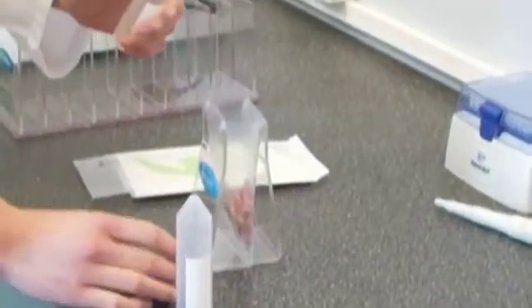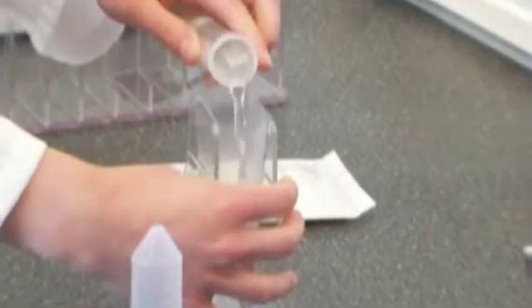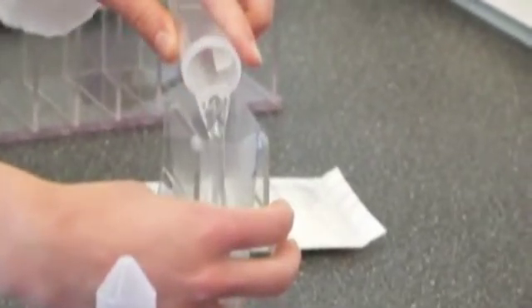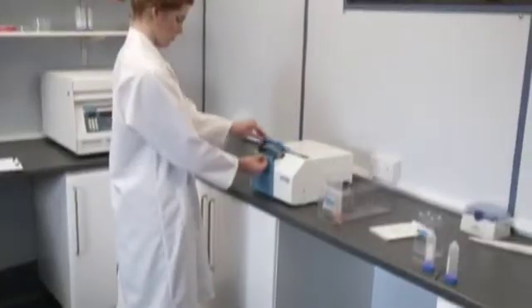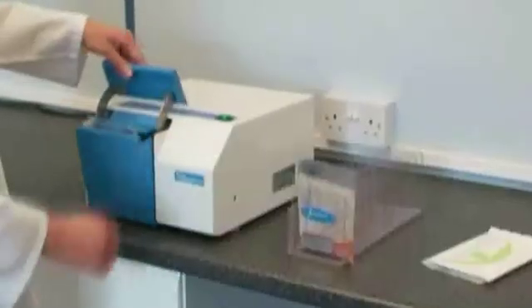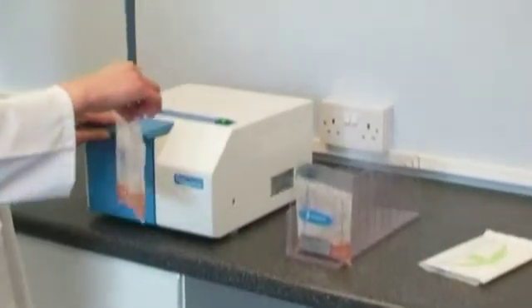A wide range of Stomacher 80 bags and accessories are also available. Complete with adjustable process time and paddle speeds, the Biomaster can be adapted to your protocols or simply use the Auto Run feature for continual processing.